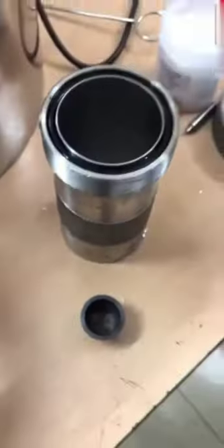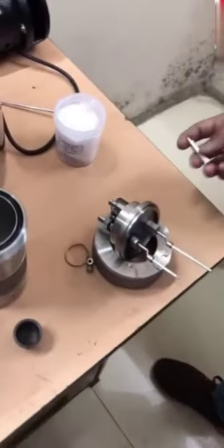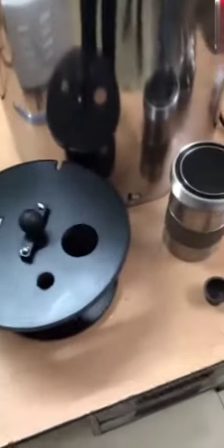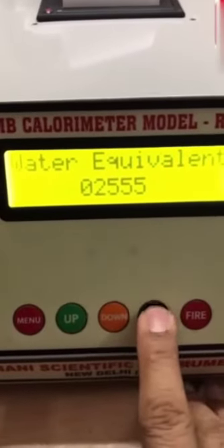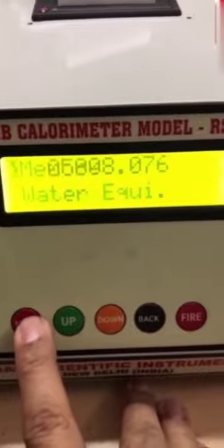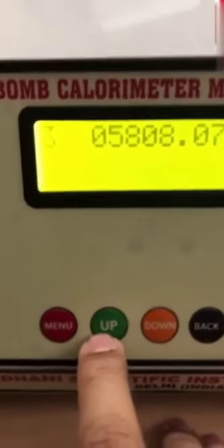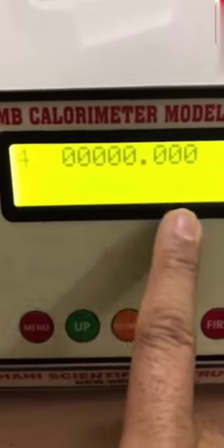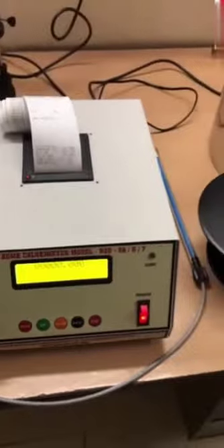This is what is desired. In case of coal samples or other samples, some unburned material is left — so we have to take notice of and measure that thing also. This is how this complete experiment is done. The last calorific value was 5808. If I go to the memory option in the menu — press up three times to memory option, then press menu button — the last result is in memory location 3, value is 5808. If I press up button it will show memory location 4, which is empty now. Whatever next result we do, its value will come to the fourth memory location. So this is all about model RSV7.